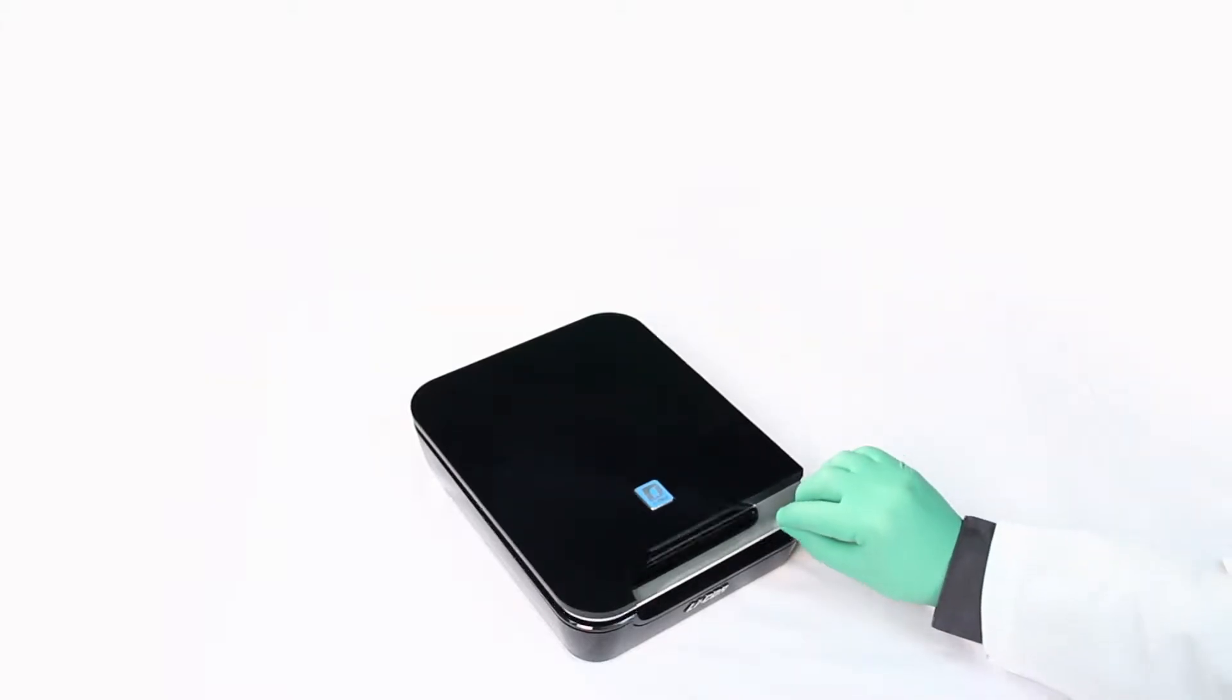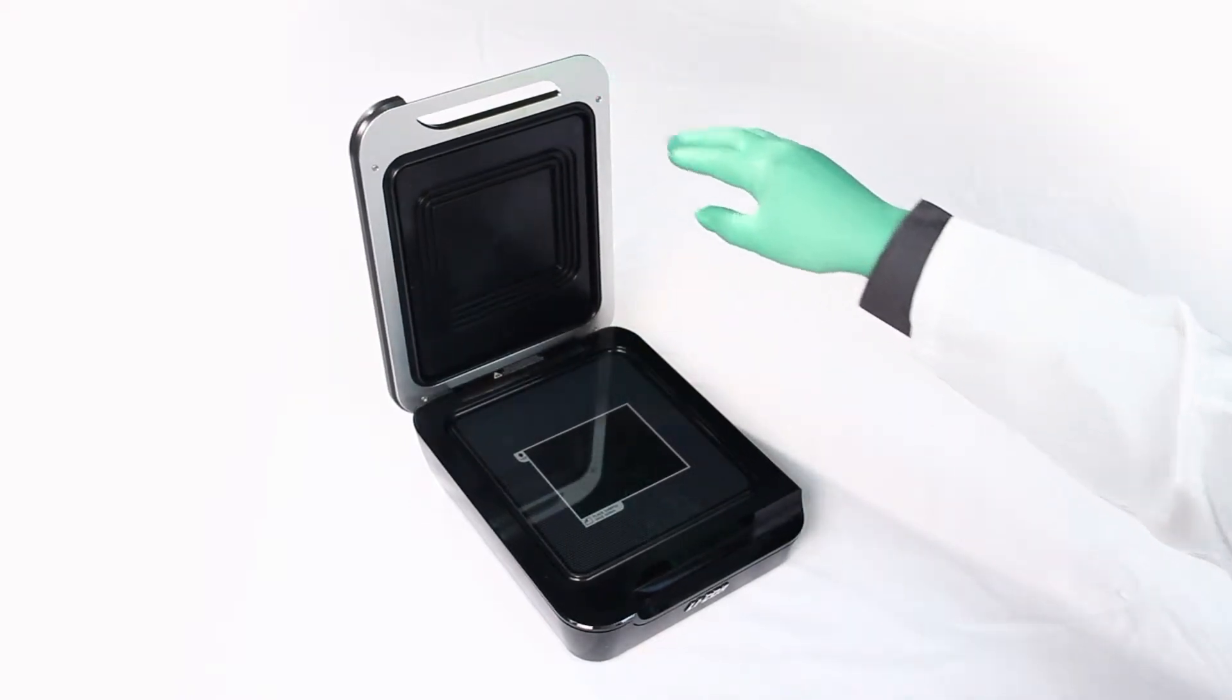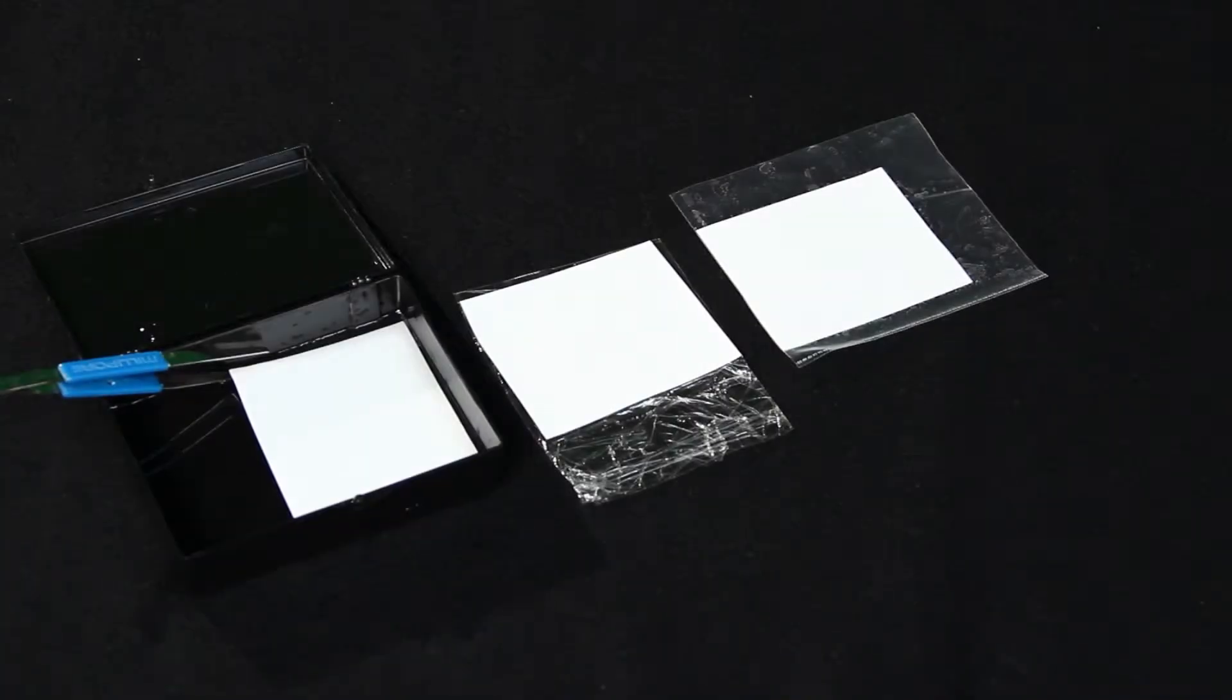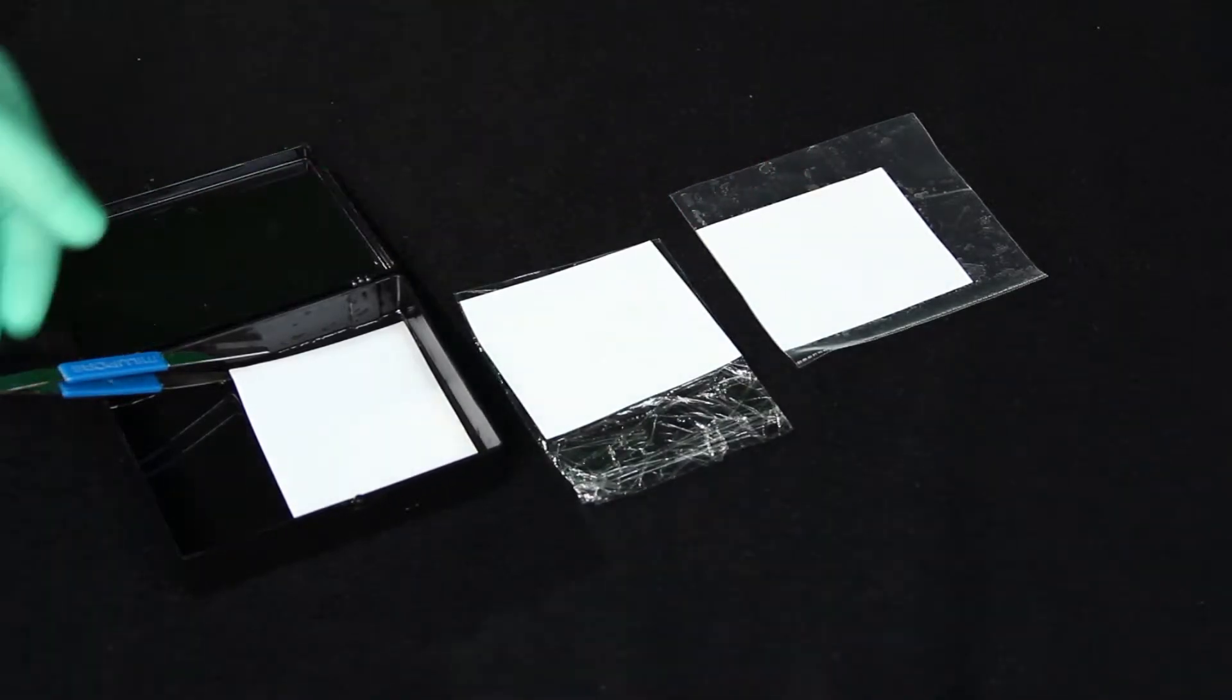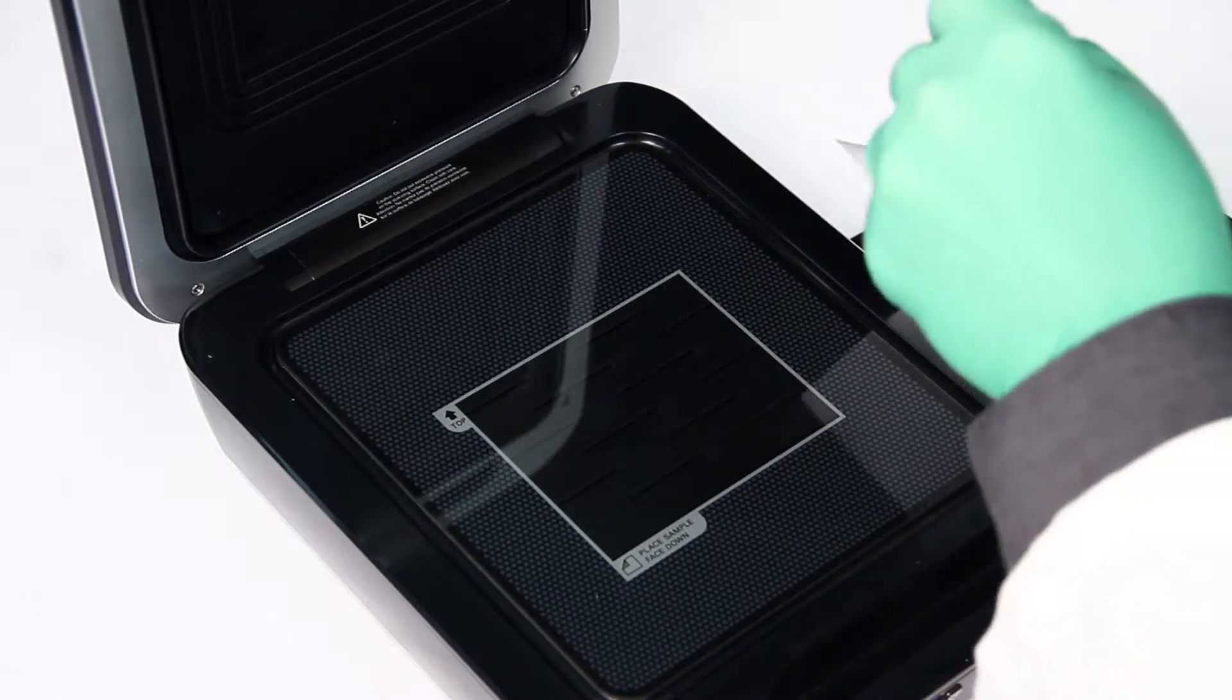The C-digit blot scanner offers flexibility in the way you process your blot for imaging. Once your blot is ready for substrate to be added, you can either choose to wrap the blot in plastic or place the wet blot directly onto the scanner surface.